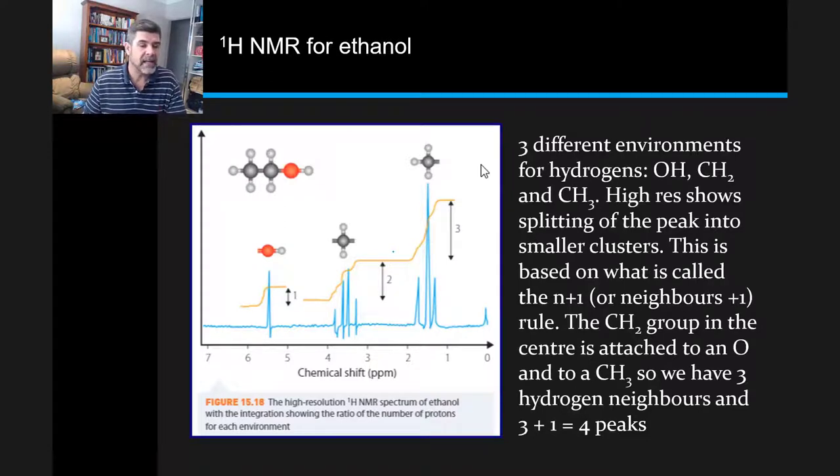You can see what's happening here is we have three different environments for the hydrogen. So this time, what we have is these three different hydrogen environments.